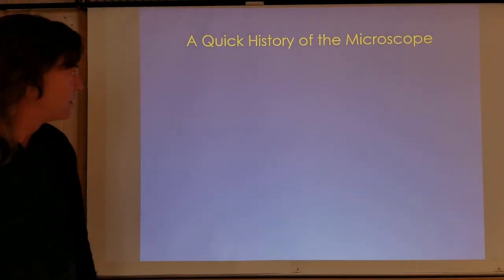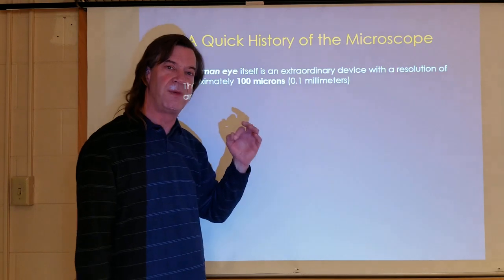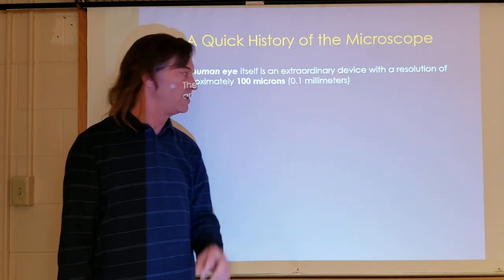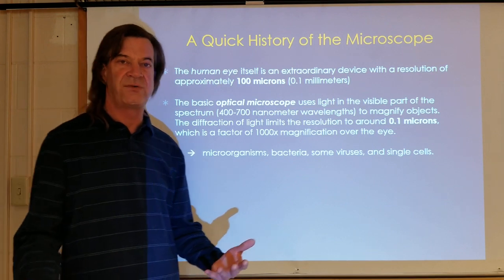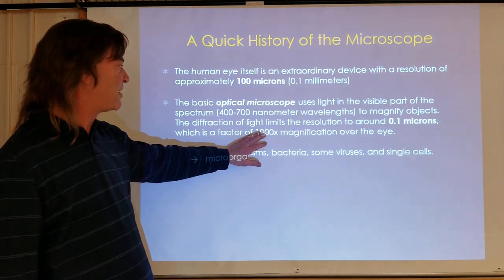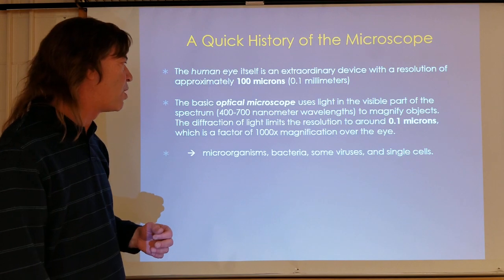Okay, now, about the microscope itself. The human eye can see down to about 100 microns, about 0.1 millimeters. That is essentially like the thickness of a thin hair. So that's pretty good. Now, the basic optical microscopes that you see in biology labs, most of those are probably around 60, maybe 100 power, but you can go upwards to around 1,000 power, okay? Which means that now, with those, we can go all the way down to 0.1 microns, pretty small.